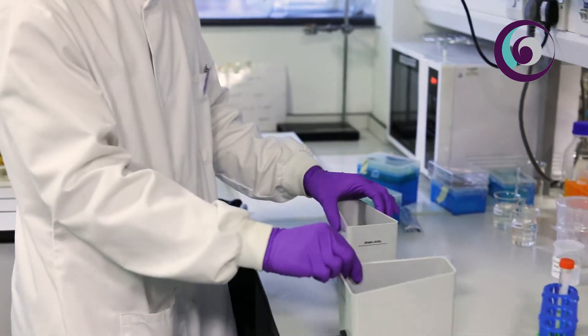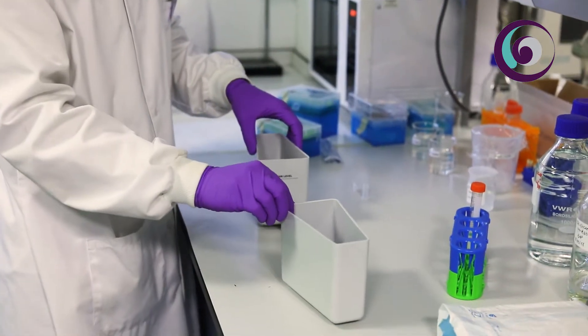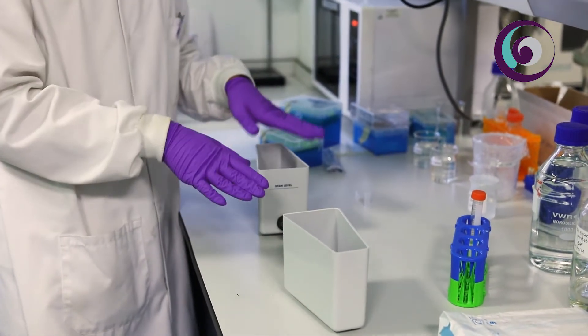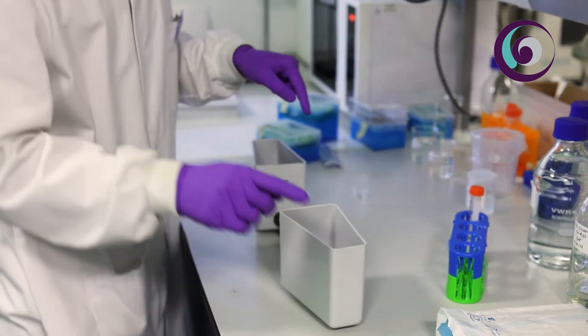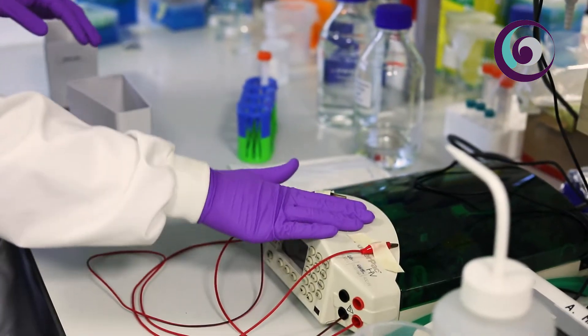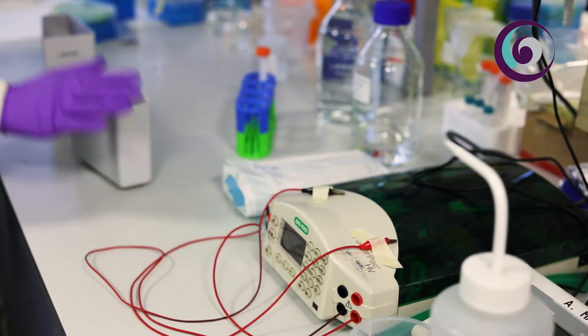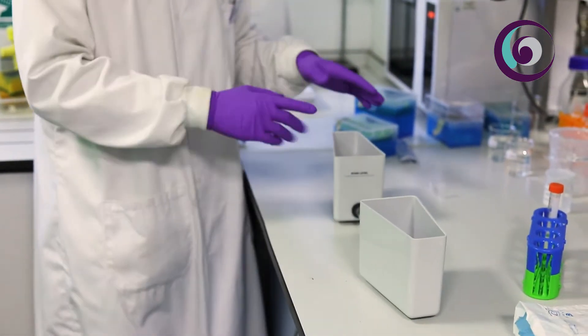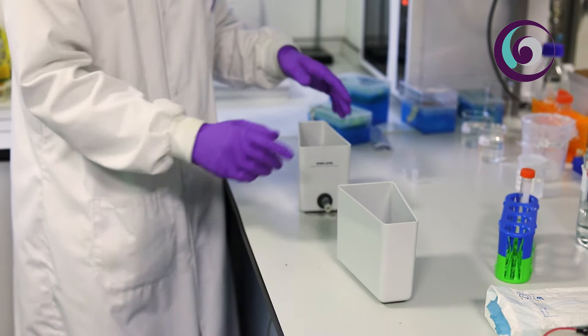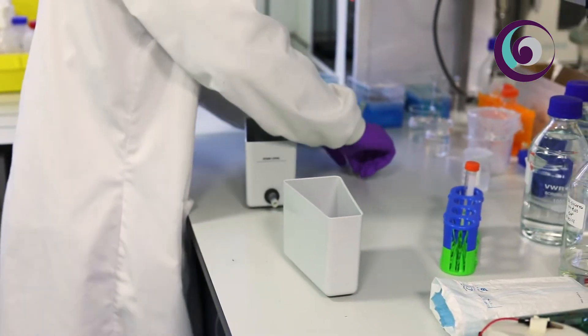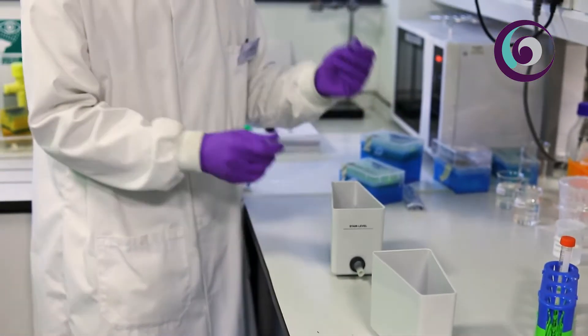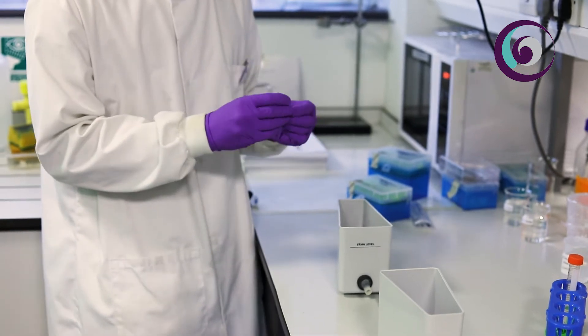The important thing to bear in mind about the 3DL is its components. The different components of the 3DL are the two buffer containers, the capsule in which we will hold the hydrogel, the power supply to which we will connect the electrodes, and finally this will close the system and allow us to move our charged proteins or biomolecules into these hydrogels creating spatially controlled chemical gradients into soft materials.